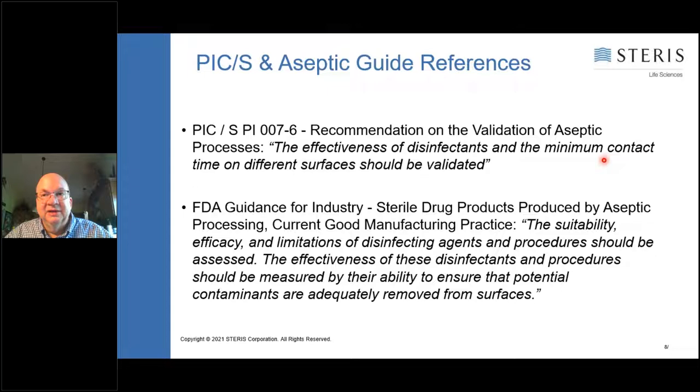The FDA's aseptic processing guide, in the next couple of years, you're going to see them pull that out from 2005 and start to update it again. But it does have a section where it talks about testing the suitability and efficacy of the disinfecting agents you have in your clean room. So it does talk about the need to validate these chemistries. So that's important.